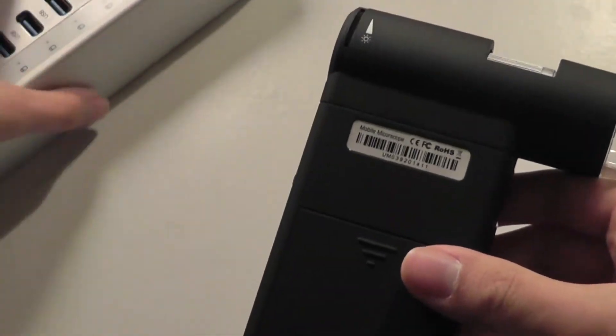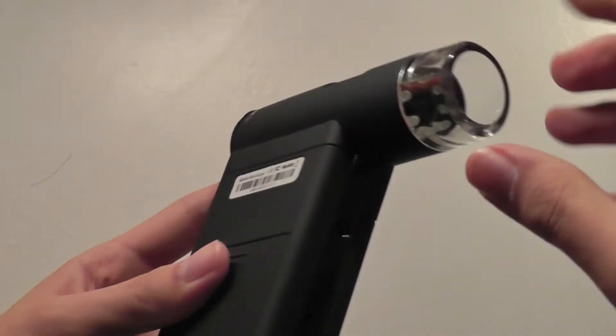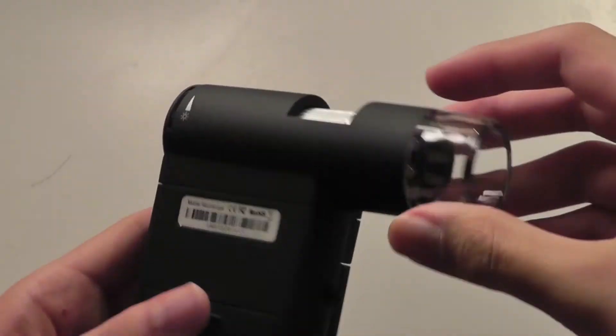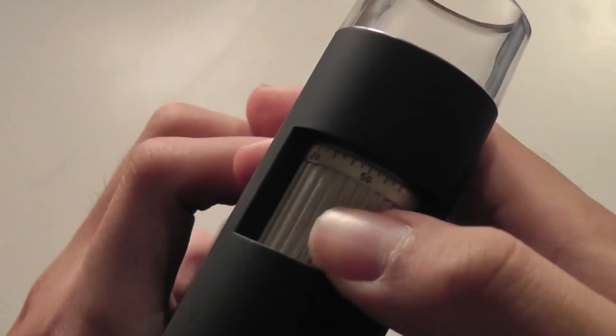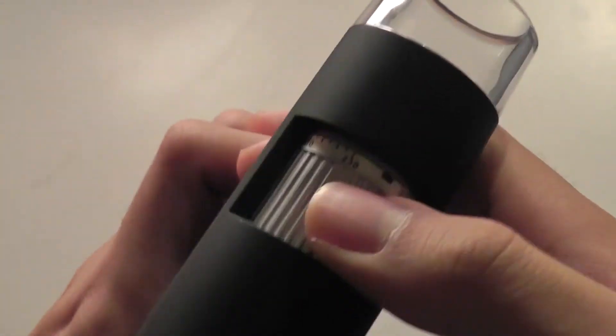One of the downsides of this particular microscope is that there isn't a built-in lens cover. You have to make sure nothing gets inside to make the lens get dirty or attract any dust or grit. But otherwise, it's really easy to use and functions very well.